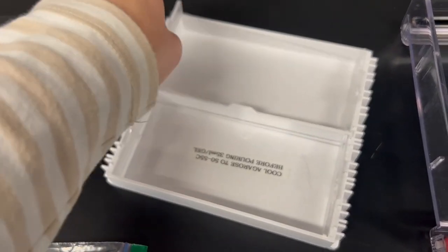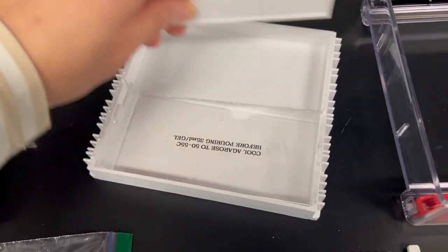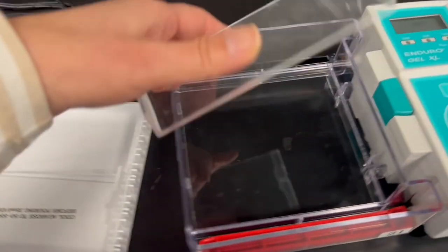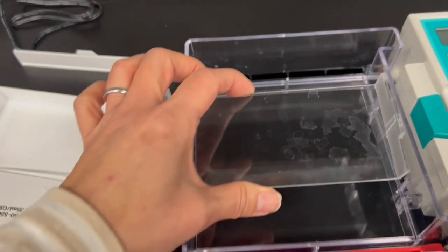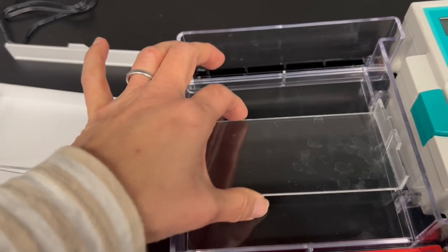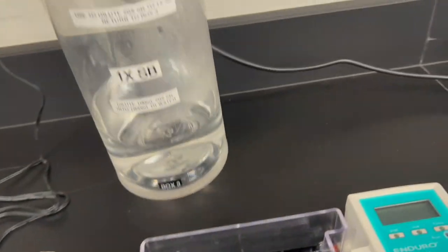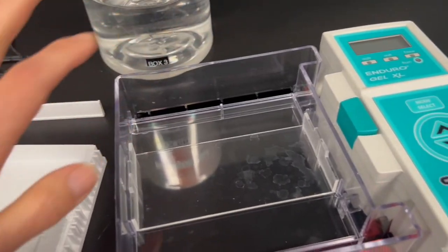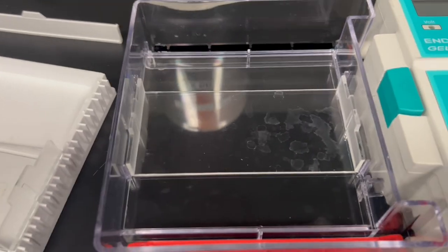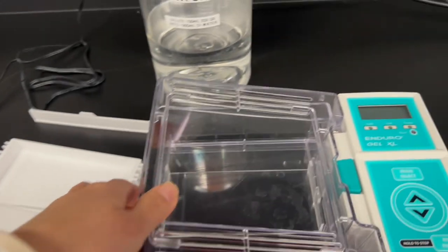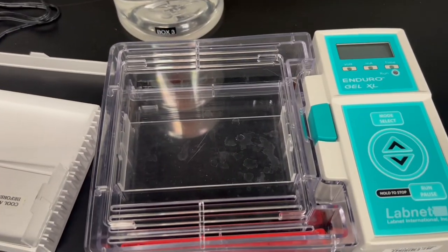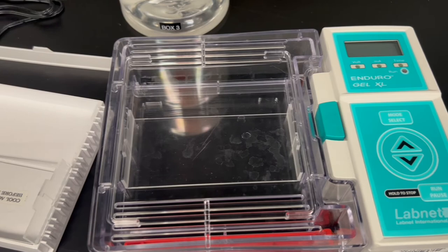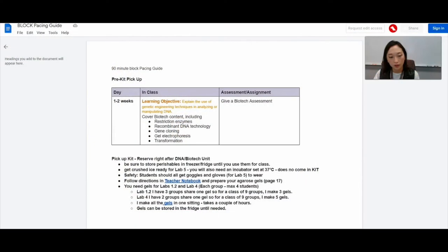And then I want to show you how to set it up into the tank. We use the enduro tank, holding it one hand. So you're going to put the gel in here and then place it in the tank. And then you have your 1X SB buffer that you're going to fill up the gel tank with. And you can cover it up. Plug it in. Super easy. Just follow the directions.